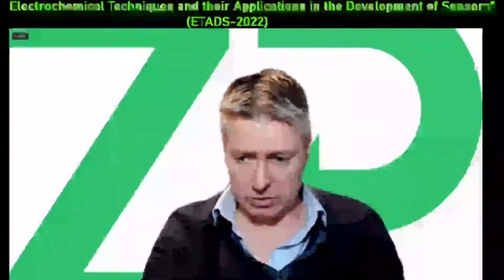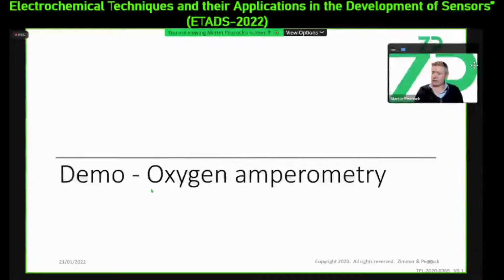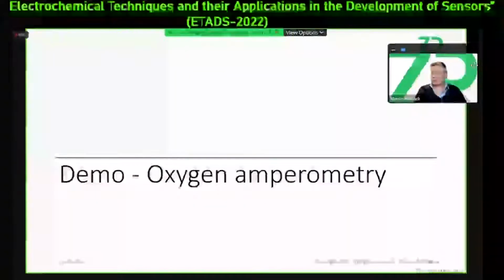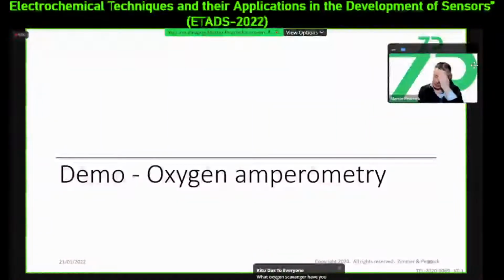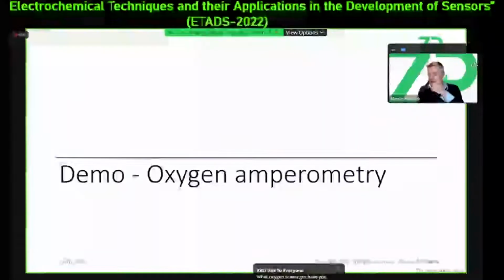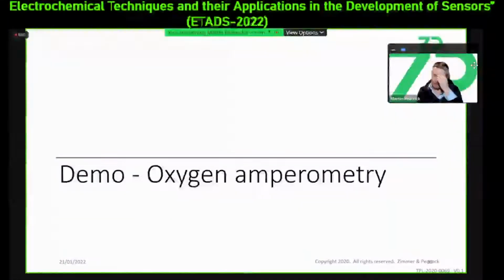All right, well, thank you very much, Andre. So what I'm going to do now is share my screen again, and we will go on. If I were to recap a little bit of this morning, we introduced our hypervalue electrodes, which the guys actually used twice. They used those hypervalue electrodes in the first CV that they did on ferricyanide.